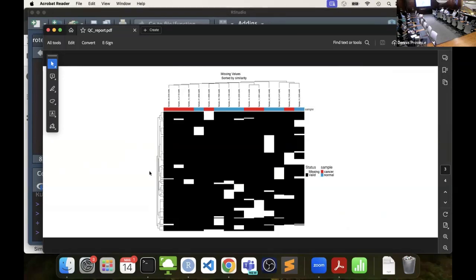Just curious, what happens, let's say you have 4 replicates and 3 give a value that's very consistent and 1 is just missing. Rather than taking the average, can you tell it to just ignore that one? So that's when you turn that to an NA value, then limma should omit it from the calculation. It shouldn't go into the fold change. If you leave it at 0, then it gets averaged in and it'll run with that calculation.